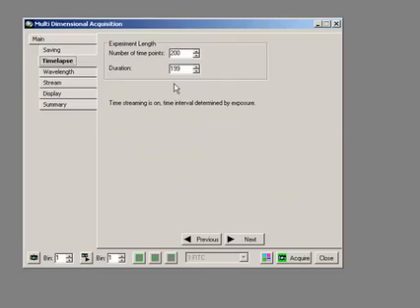When I go to timelapse, you can see I don't have a time interval. My time interval in a streaming mode is determined by my exposure time. Later on we can talk about streaming and wavelengths, and I can stream very quickly between wavelengths. It goes as quickly as I possibly can, but the exposure time has to be identical for each wavelength.